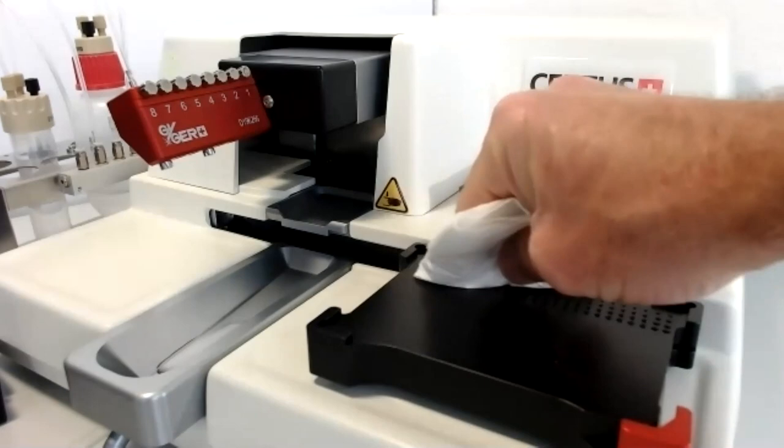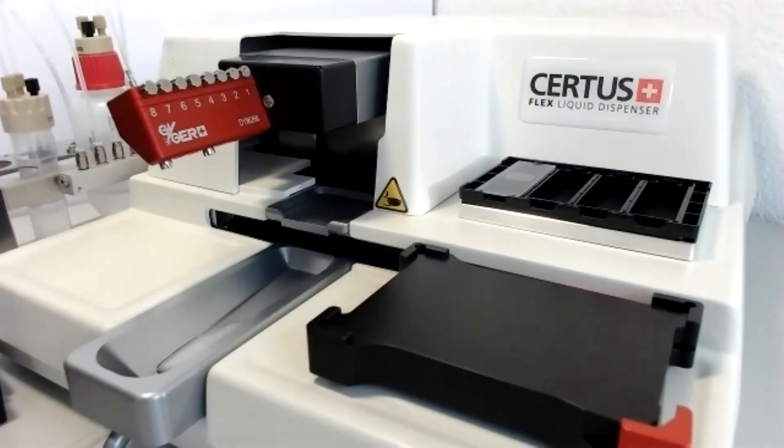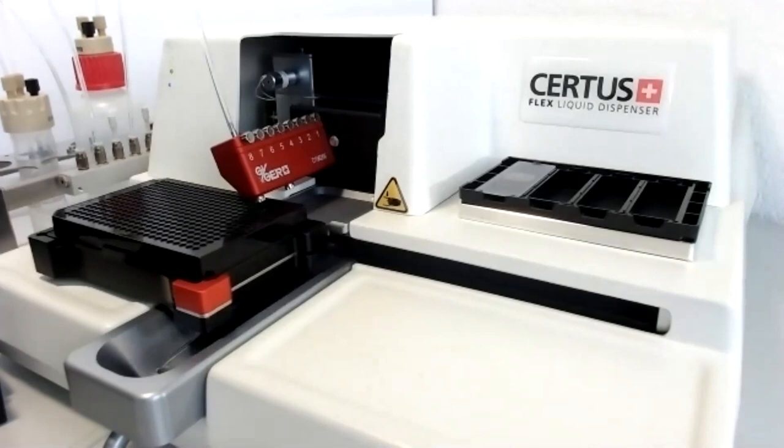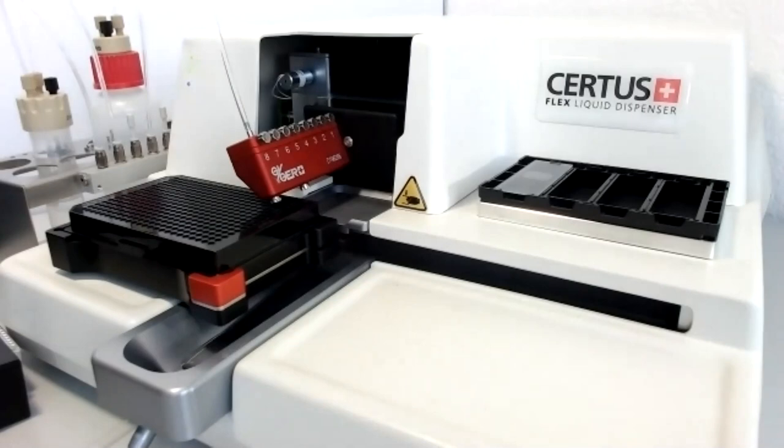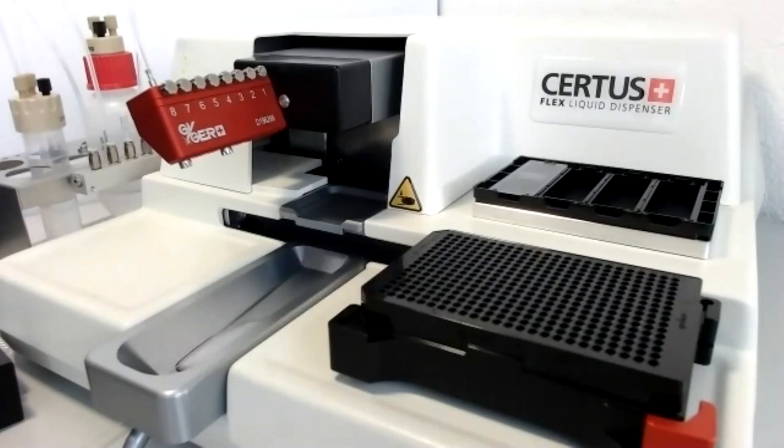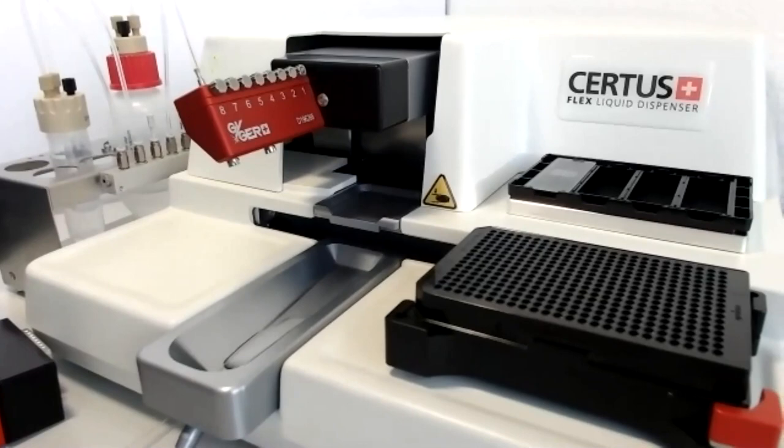Yeah, so cross-contamination was never an issue we saw in the past because it's a non-contact dispensing technology. There is almost no risk to get cross-contamination. I'll try to show you how close the valve is above the plate by starting the same protocol again. It's maybe hard to see, but there's only a gap of one millimeter. And there is no chance for cross-contamination. And our micro valves are precise enough to not create satellites or splashing.